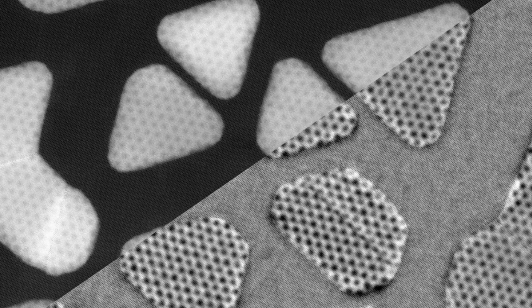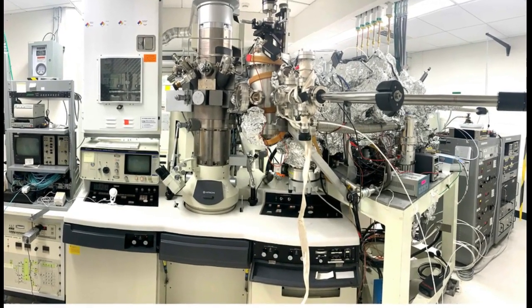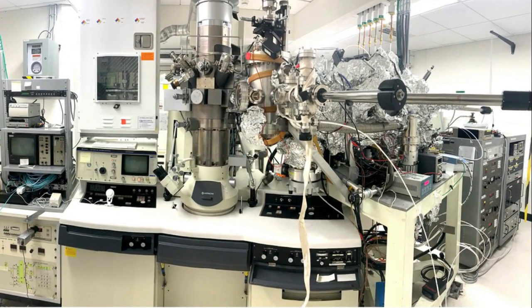But the team figured out a set of algorithms that allowed them to extrapolate back from images of the sample, which look somewhat like a set of overlapping shadows, to figure out which configuration of stacked layers would yield that complex shadow. The team made use of two unique transmission electron microscopes at MIT that enable a combination of capabilities that is unrivaled in the world.